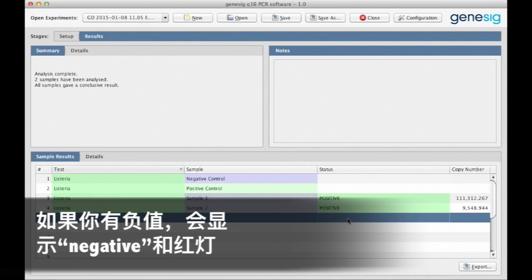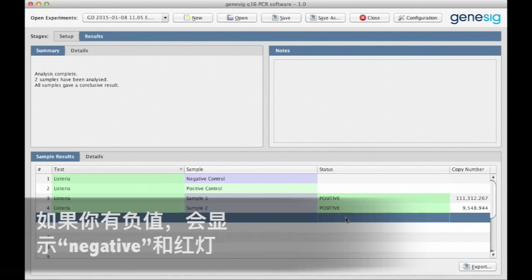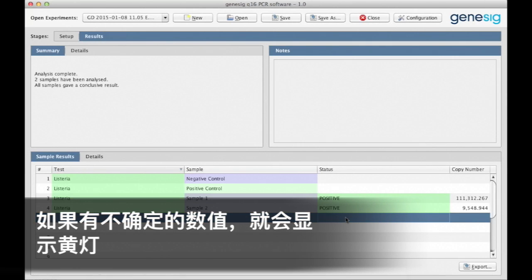If you have a negative result, the word negative is displayed and the color is red. And if you have an inconclusive result, then the field is colored amber.